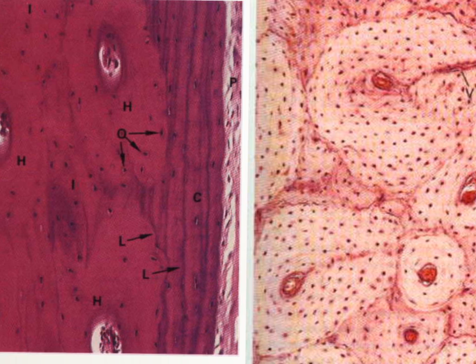In the second picture also, as it is stained, it is a decalcified compact bone. What can we see here? You can see the Haversian blood vessel.